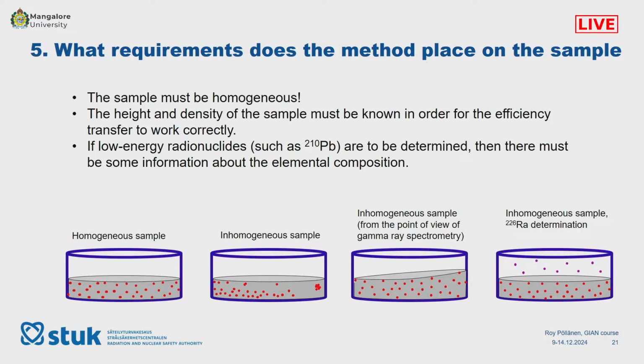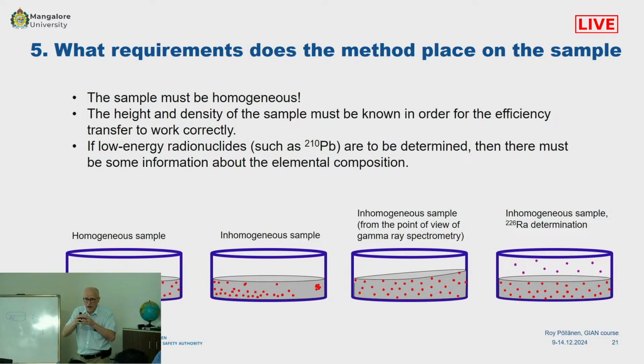You have a little bit different approach in your laboratory here. We have only one efficiency calibration of each detector, except those Marinelli detectors. We have some of these too. But I think you have several calibrations. You mentioned, is it 16 or 18 calibrations? Yeah, more than 10. We have RGU, RGK, RGTH.